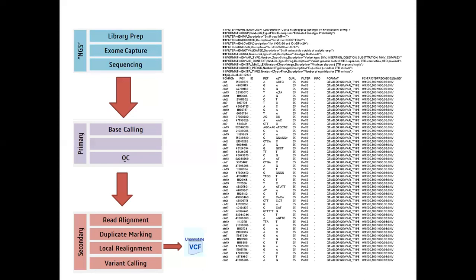Okay, because our main focus is NIPT samples, ma'am. The NIPT pipeline is different. But yes, once you get the variants, the interpretation remains the same. Thank you, ma'am. You can go ahead.